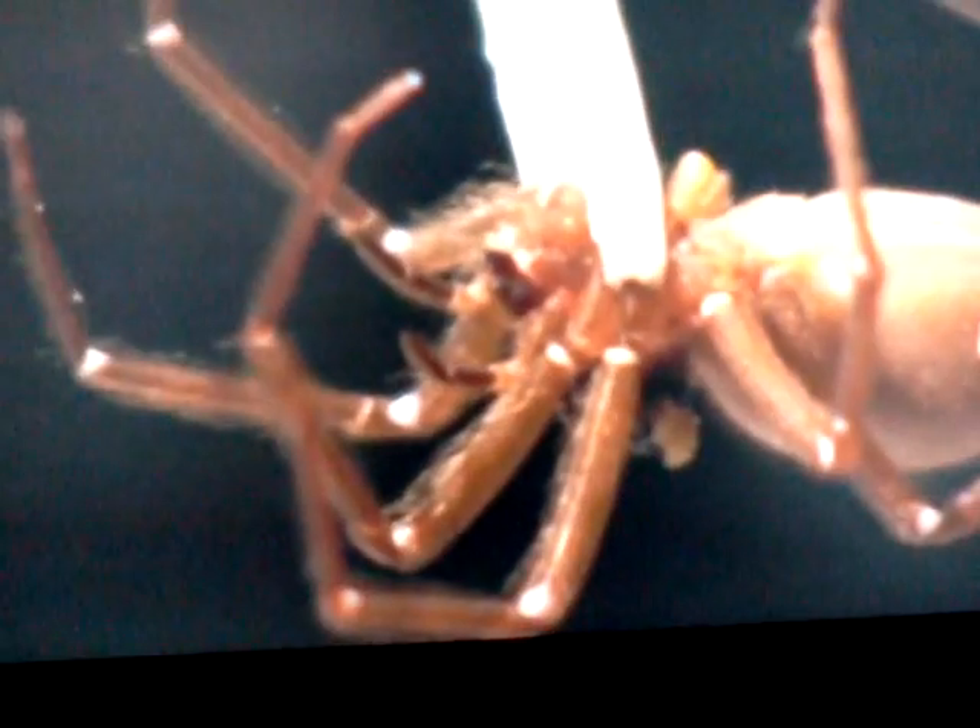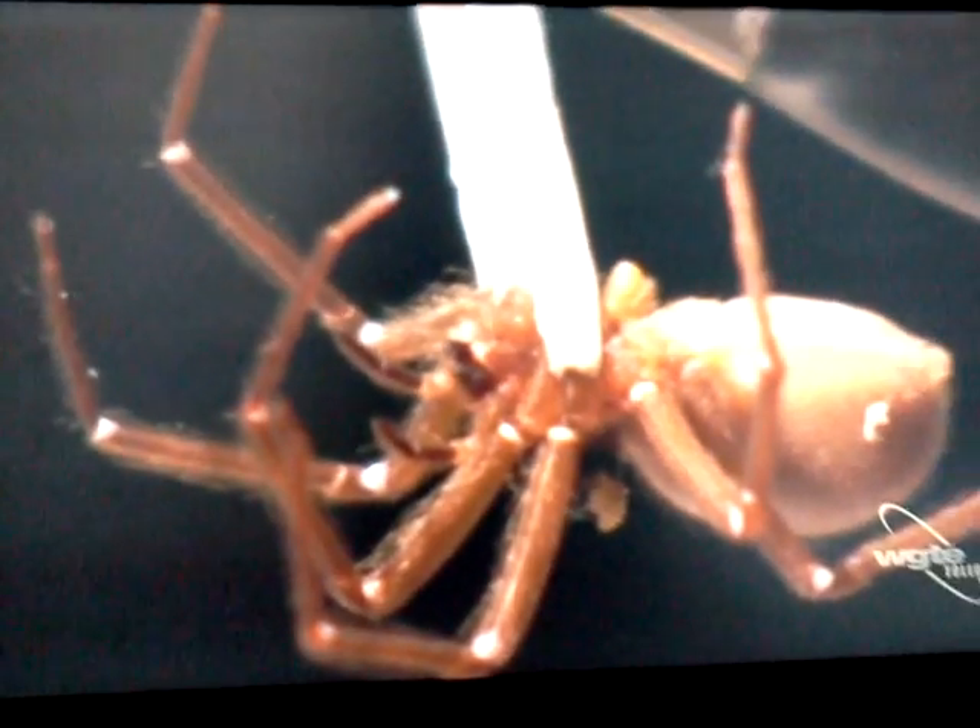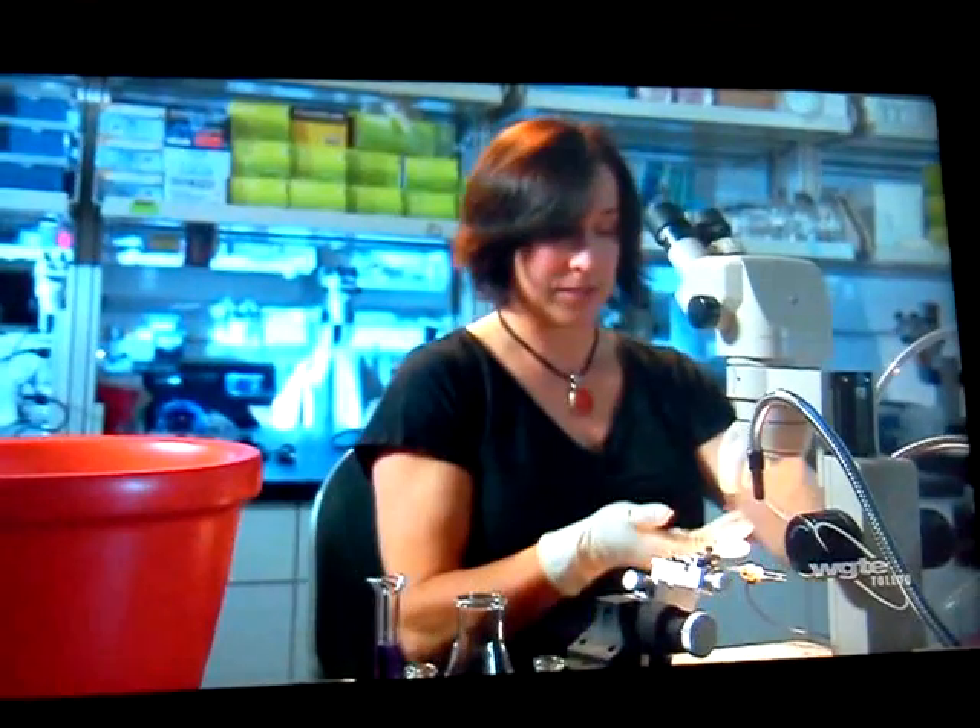Excellent. There you go. Thank you, spider. She'll wake up in five minutes and be just fine.